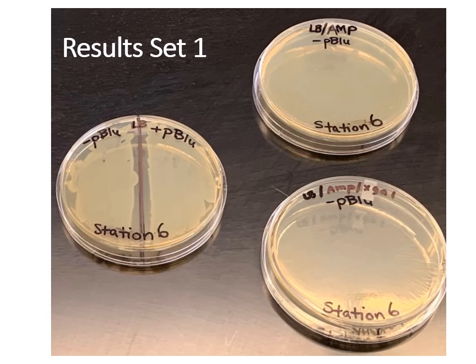Now, the last aspect of this virtual lab is that I am giving you various examples of actual results, okay? And I want you to analyze them. You're going to do that in the post lab. And like I said, I could give information in terms of a quiz where I describe a plate and you should be able to pick out the analysis. Now notice that the plates will always be labeled as to whether they're LB, LB amp, or LB amp and XGAL. They will also tell you the type of sample.